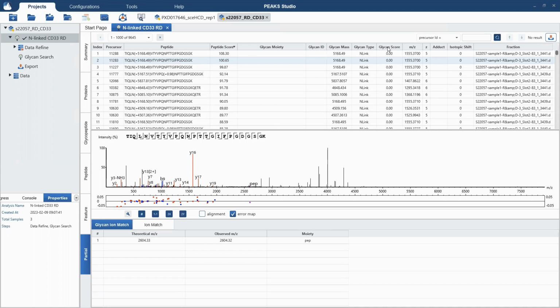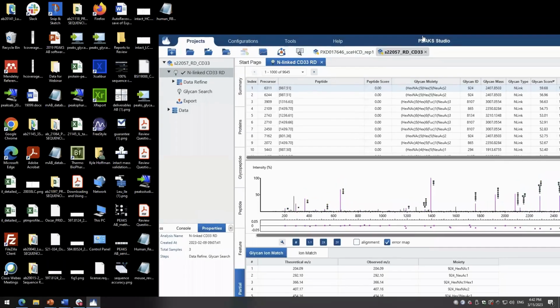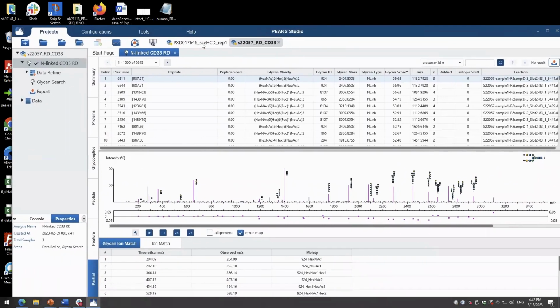And also, we can have glycopeptides where we have a glycan and good glycan fragmentation ions to support this ID, but we just haven't been able to sequence the peptide. So we'll assign this mass tag associated with this glycan moiety there. Sorry, I can't quite see this.